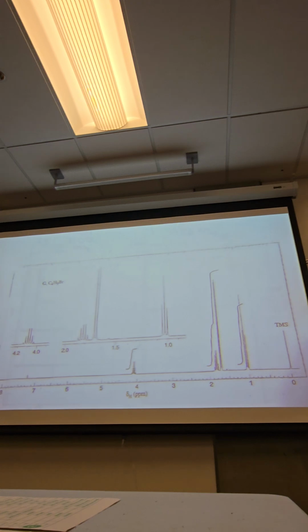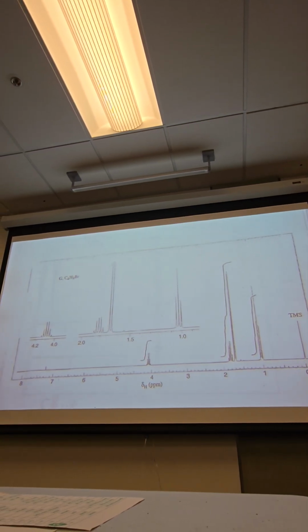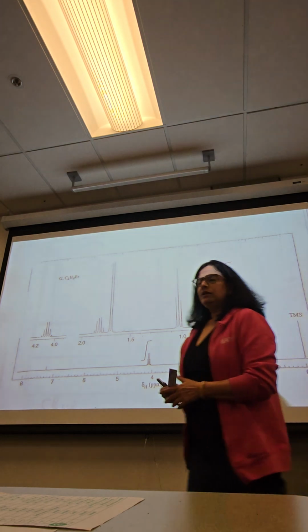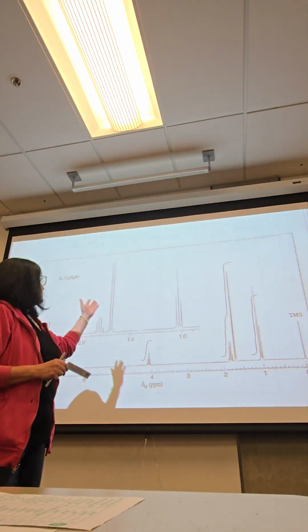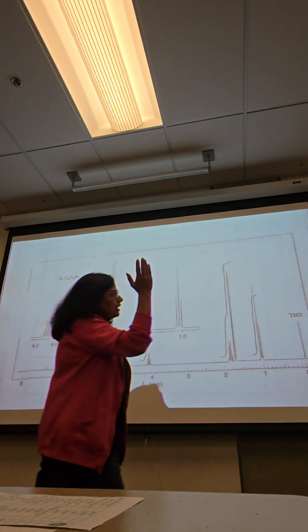Now, when it comes to NMR, I always say keep a ruler handy. Keep a ruler with you, because there are some measurements we have to make. Do you guys have rulers with you? No. Okay. Keep a ruler with you, because you will need it for NMR. Like this one. Is this the next one on your handout? Yeah, cool. Perfect. Now let's start from the top.